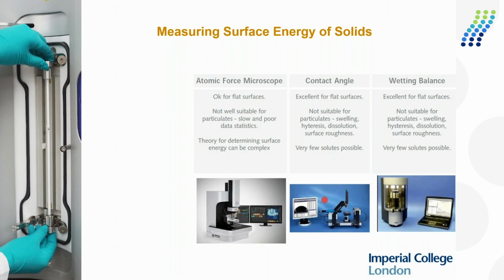But of course, if I've got materials that swell or dissolve or are rough, then these techniques become a little bit difficult. And indeed, in some cases, quite challenging. And for powders, they're very difficult, as we'll see in a moment.